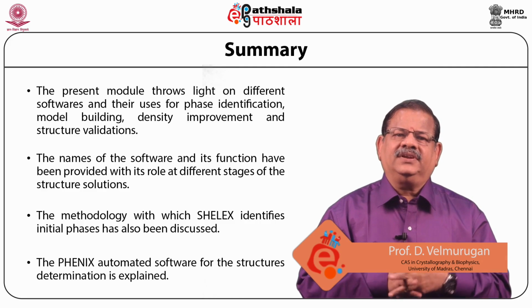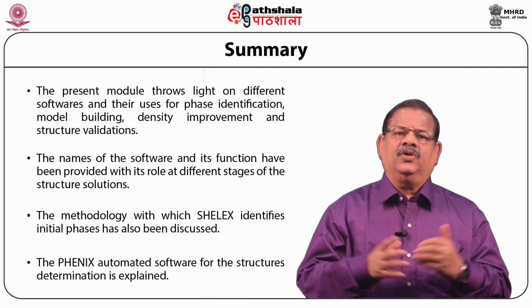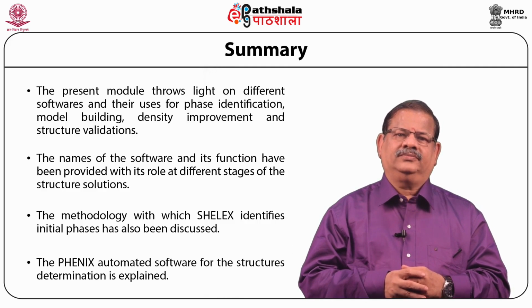The Phenix automated software for structure determination is also explained in this module. Thank you.